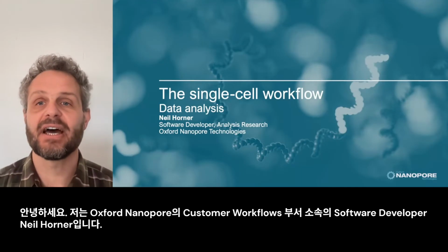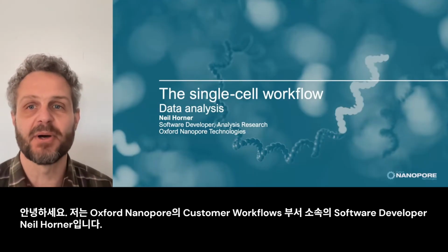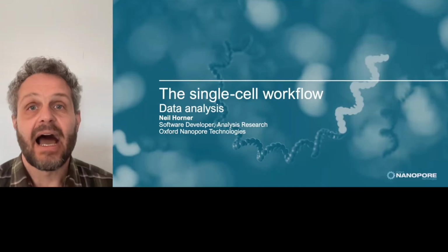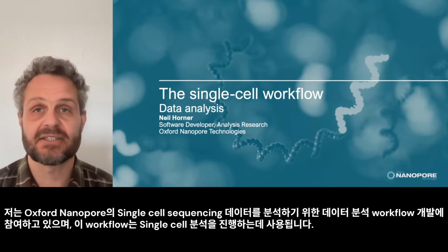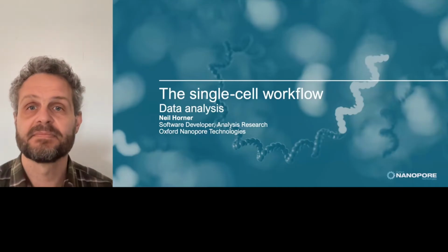Hi, I'm Neil Horner and I'm a software developer in the Customer Workflows group here at Oxford Nanopore. So thanks to Rebecca for talking about the wet lab side of things. I'm involved in the development of the data analysis workflow for analysing Oxford Nanopore single cell sequencing data, the workflow wf-single-cell.